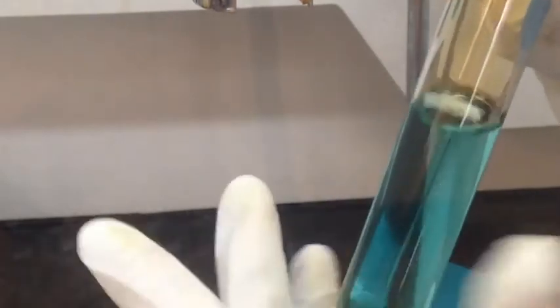The green color is still staying at the bottom, because I have added too much water. Anyway, while I'm shaking, we are making the reaction more complete. That's why you can still see some brown gas coming up right above the solution.